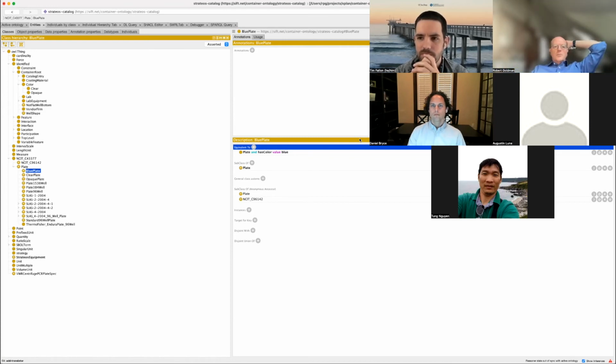Our local catalog number for that is X. And then you could say, I'm just going to do a query and say, find me all the containers that meet the description in the way we've talked about so far, and then tell me what their local catalog numbers are, so that I can look up in whatever tool we have locally and say, do I actually have any of these on hand, or do I need to order them?